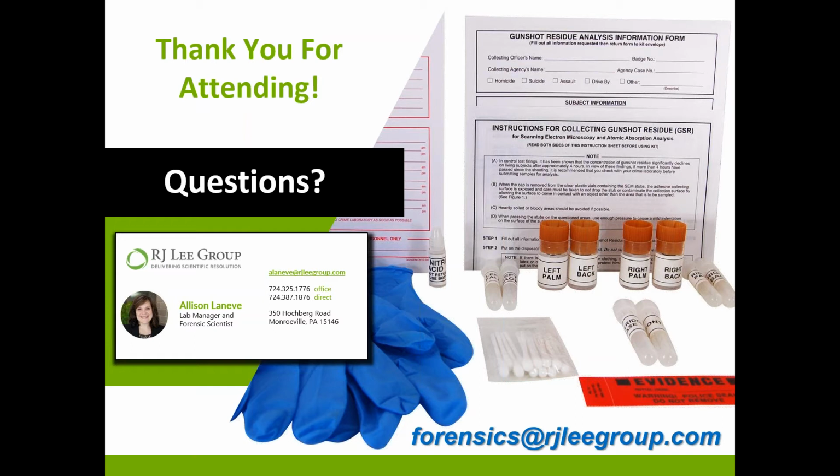And it might not seem as if the dabber is as sticky, but believe it or not, it actually is. You just can't see it. These particles are so small that not only are they using the adhesive property of the material, but they're also kind of using the electrostatic forces to pull the particulate onto the stick as well. So 2 stubs, 1 for each hand, is totally fine.